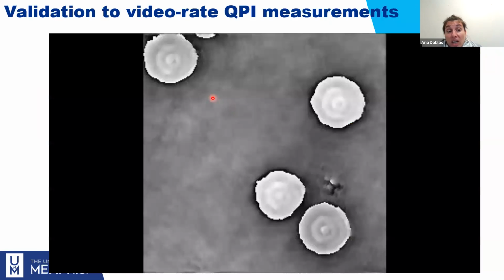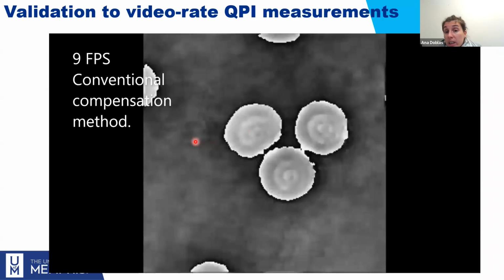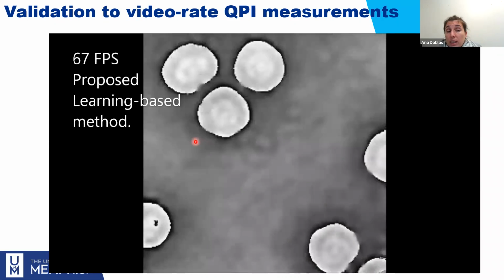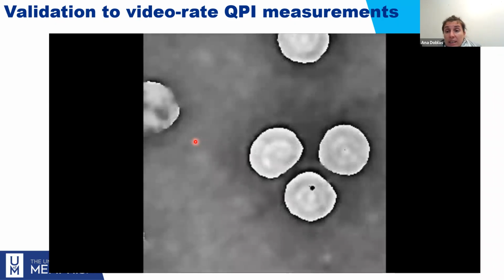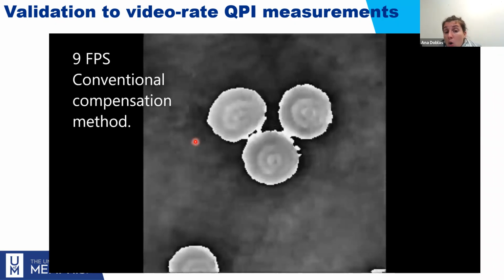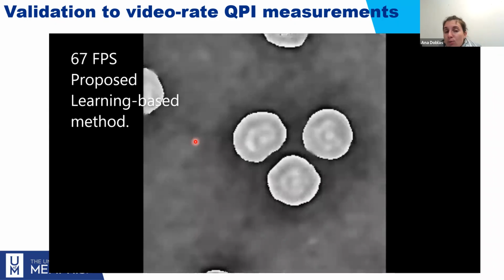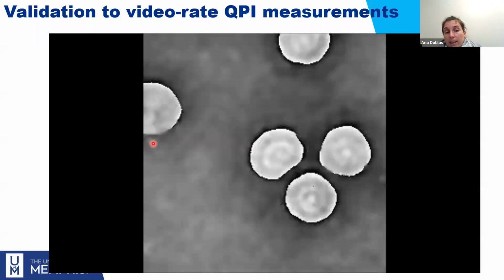So we trained it, and those are the images. This is the video of red blood cells moving. You see that the first image, with the automatic method, was still having problems. I'm going to run it again. The red blood cells were not always restricted, they were changing. This is the result from our model. There is still some failing, and we see some blur at the end, but our model provides less noise, less phase distortion, and it works for most of the frames.